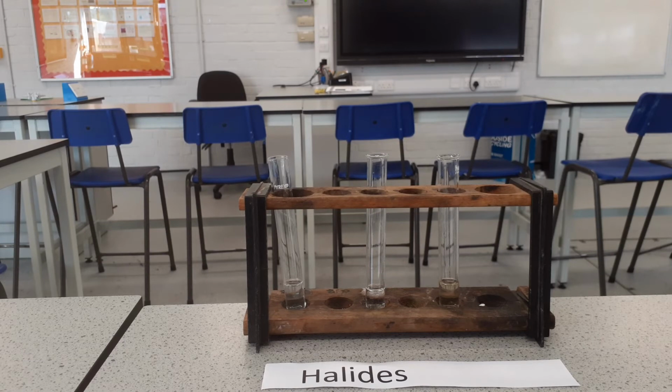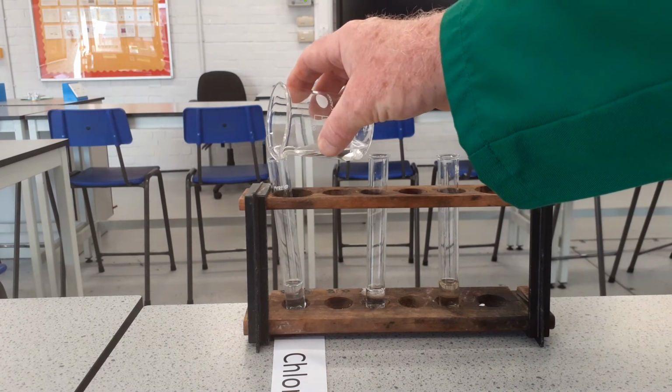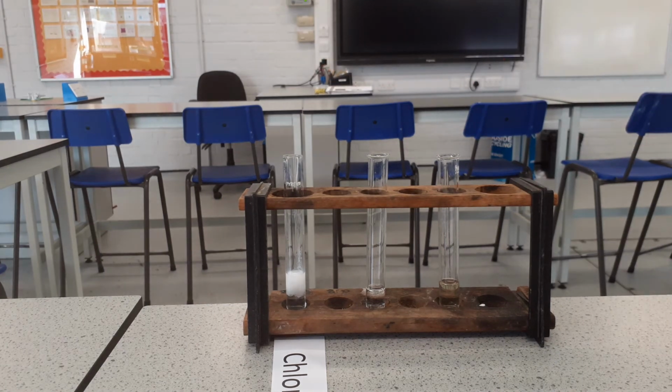Okay, the last anion is the halides. Now, halides: chloride, bromide, iodide. Now, the test is the same, but we get a different colour result. So that's how we tell one from the other. So, first of all, first one I'm going to use, this is chloride. So, I add to my chloride a little nitric acid. To that, I add then silver nitrate solution. As you can see in my silver nitrate, I get a white precipitate.